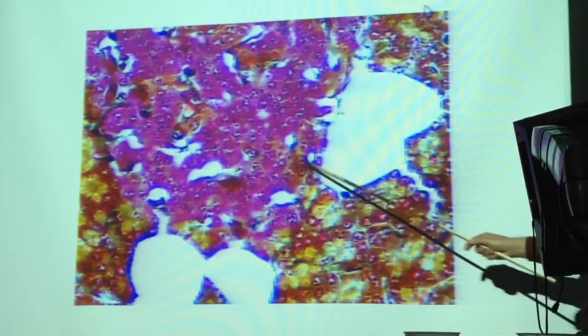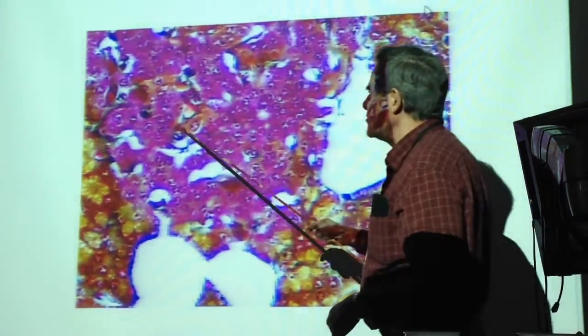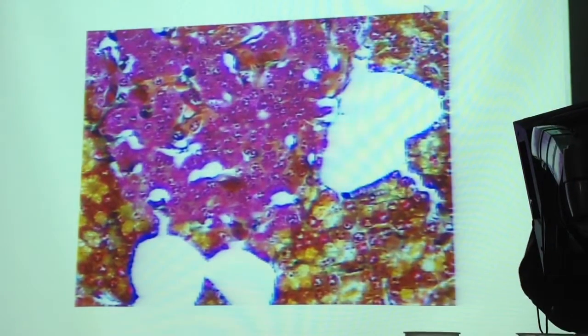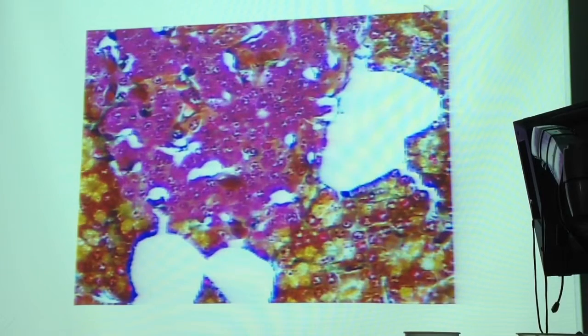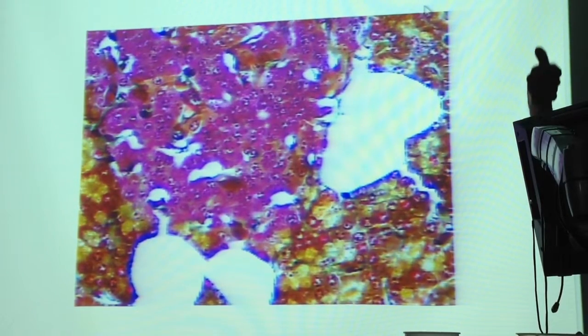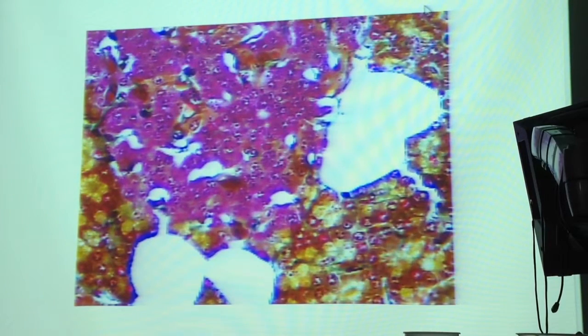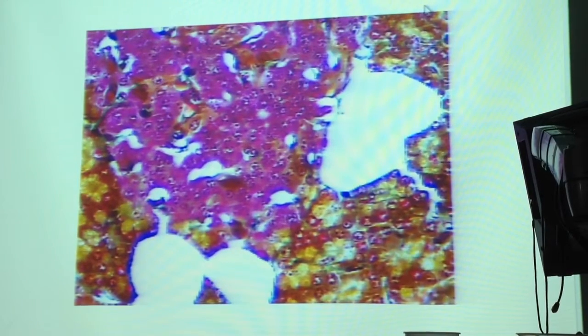Second most abundant are these dark brown cells. And again, we're looking at the cytoplasm. The dark brown cells are called alpha cells. You may remember they produce glucagon. And glucagon, remember, elevates glucose levels in the blood. Between those two hormones, most people can regulate their blood sugar levels. Insulin to lower glucose levels, glucagon to elevate. Glucagon stimulates the breakdown of glycogen and release of glucose in the blood.